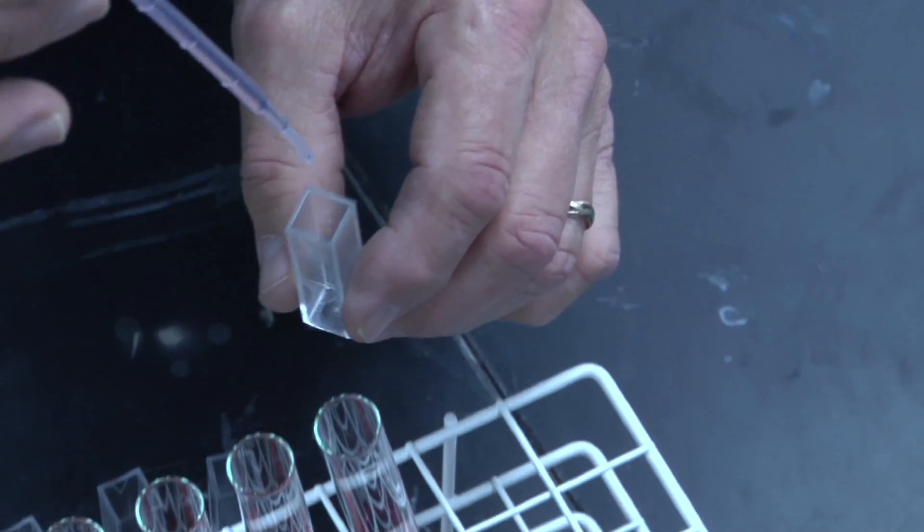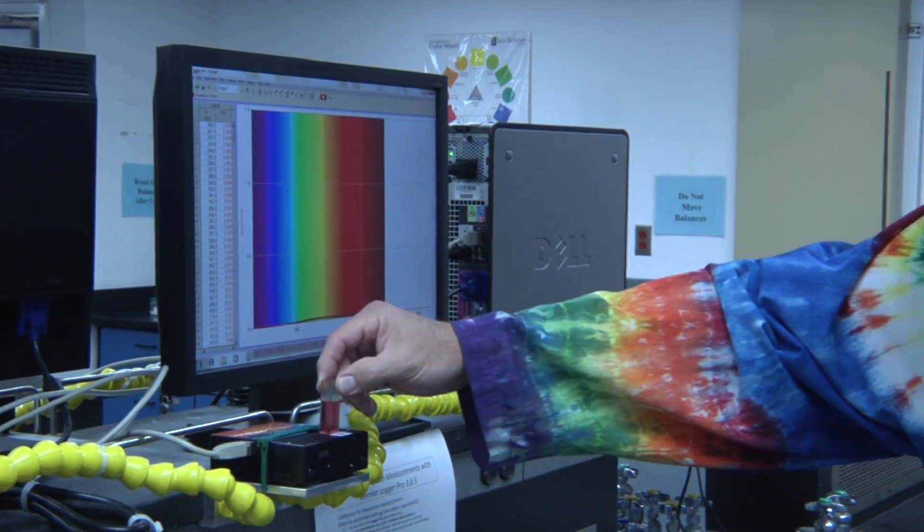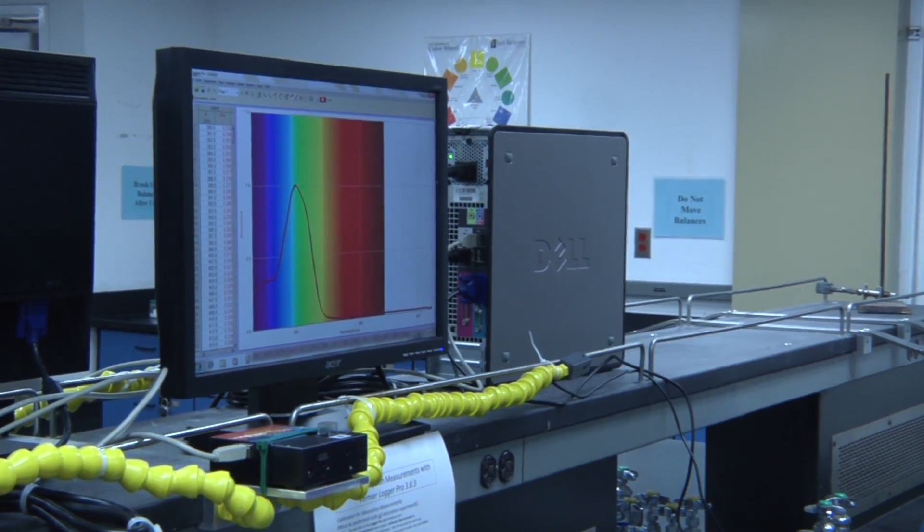This short video will demonstrate how to determine the molar absorptivity for a food dye using materials available in our lab.